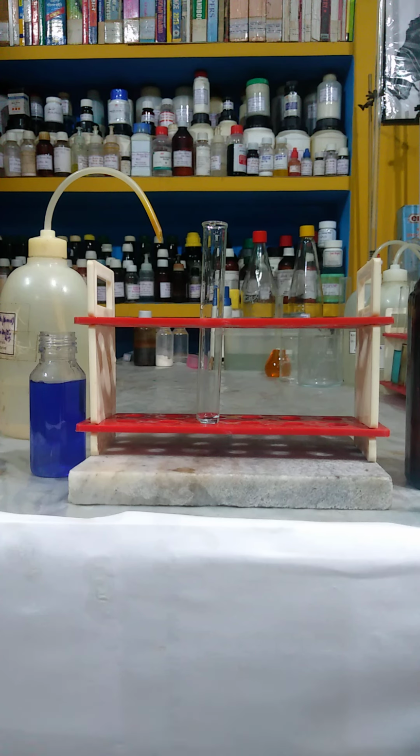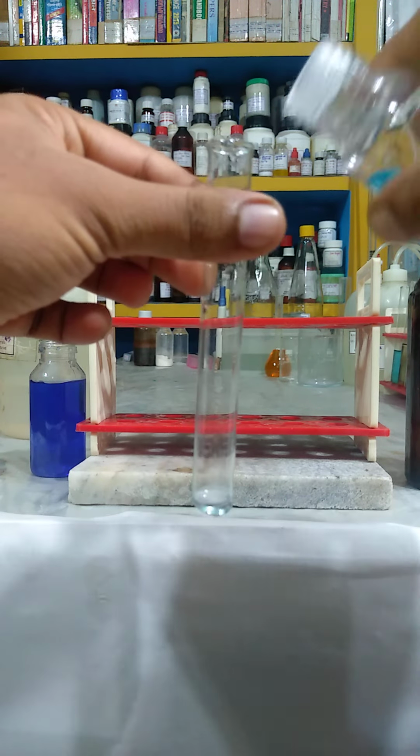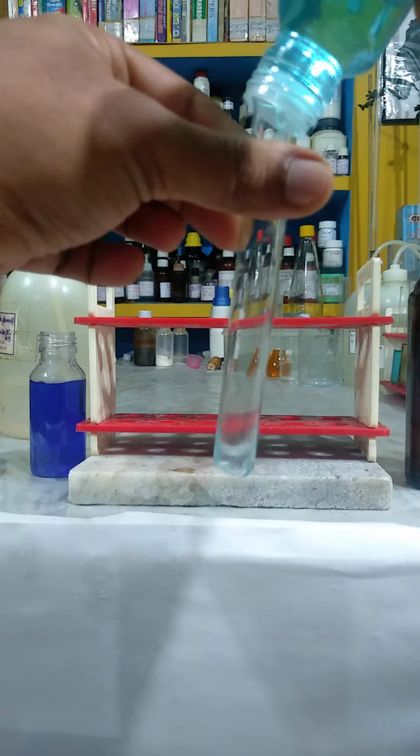Today I am showing you the reaction of copper sulphate, or CuSO4, with excess amount of ammonium hydroxide, or NH4OH. First I take a test tube, then I add some amount of copper sulphate solution, CuSO4 solution. It is a neutral solution. Then I am adding some amount of ammonium hydroxide solution, or NH4OH solution.